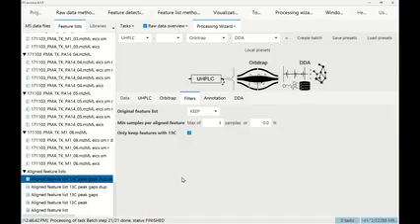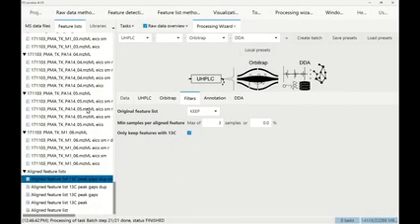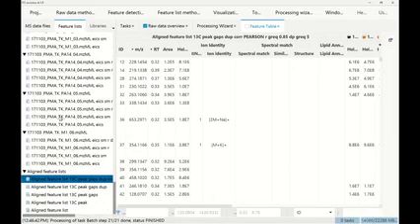So maybe hands up if you are having any issues, or did you finally get to the feature list? No hands up, so I imagine that most people are watching, or maybe they actually managed to process. Okay, and from here, similar to the raw data overview, we can just open the aligned feature list. For you, I think you should not see all the other feature lists, but we can just double click on a feature list and then open it in one of those windows.